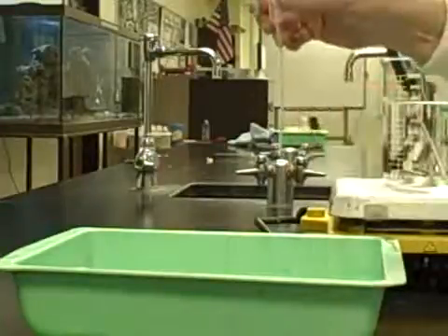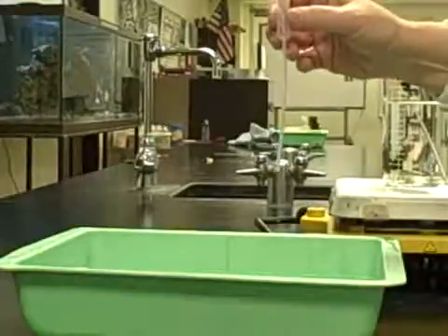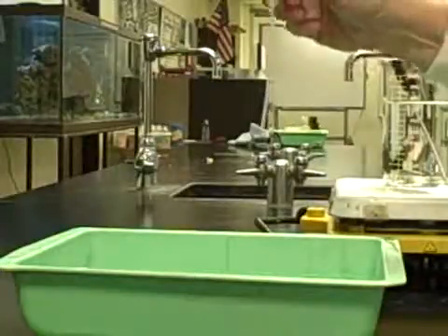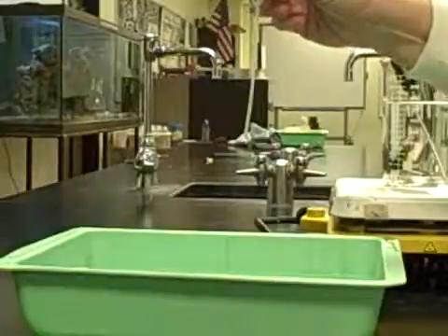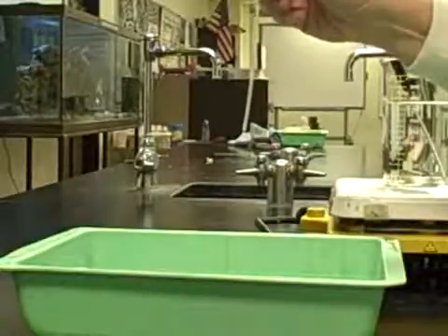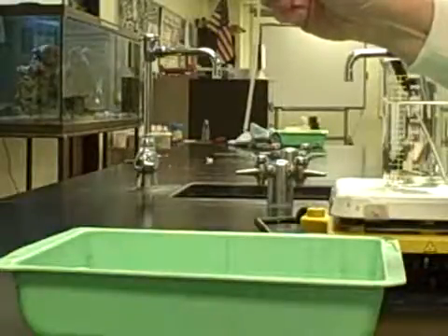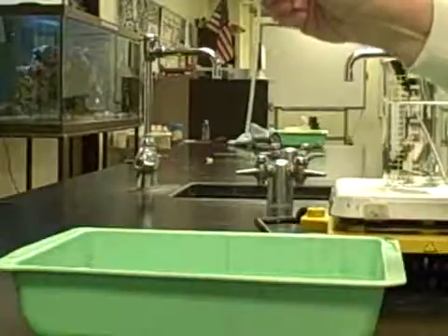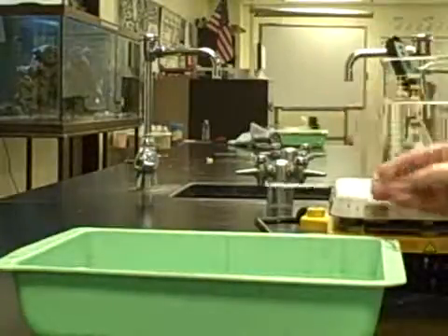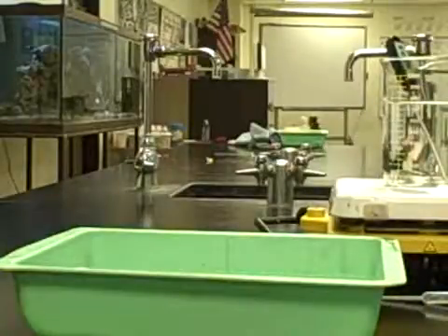And again, make sure my hands and the pipette are both dry. And I'm going to try and count my drops, squeezing them out the same size as I did before. I've got 1, 2, 3, 4, 5, 6, 7, 8. 8 drops that squeezed out of there. So this is the water that was pushed into the pipette as the gas cooled off.